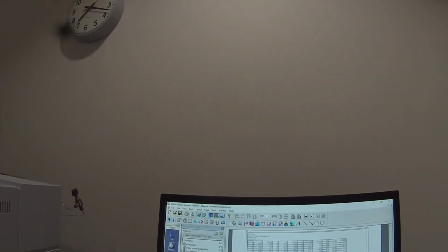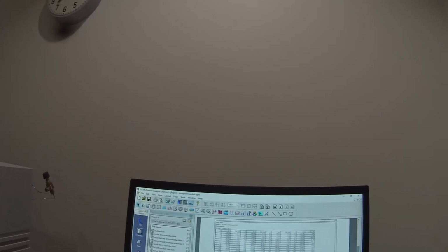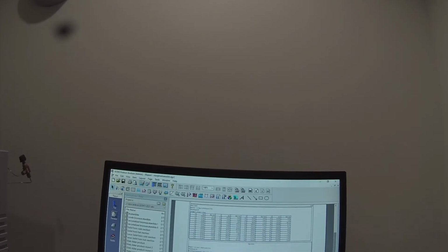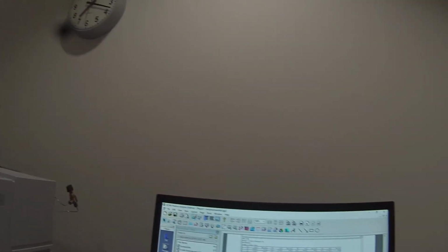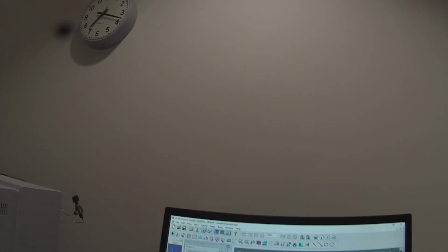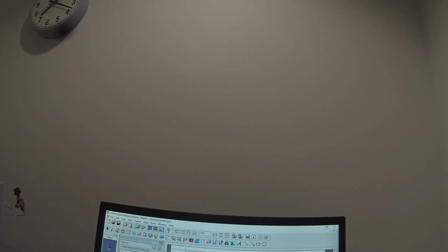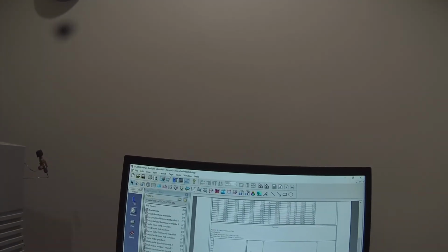I'm then going to right click on it and go to Spectrum Object Properties and tell it that what I want to see here is peak 3. And the same here. Mass table properties. And what I want to see is peak 3. And I expect the peak at 7.4 and the peak at 3.397 to be about the same. The base peak was different for those two, but they're very similar.